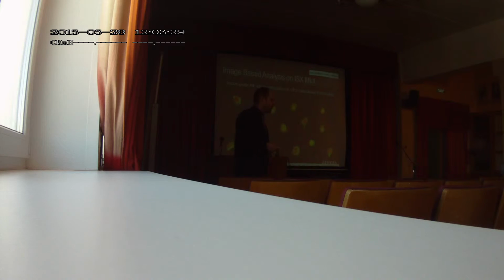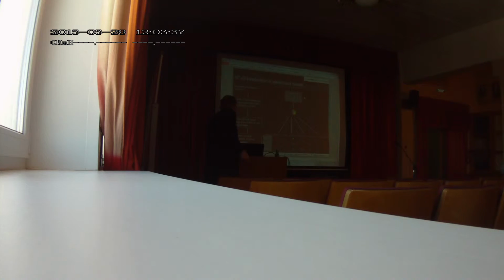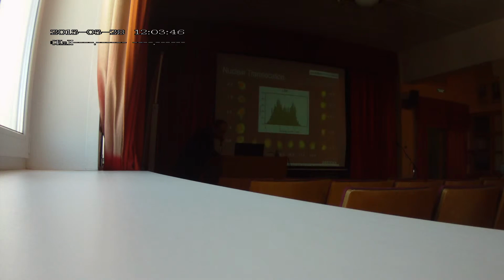But before I go there, from the point of view of the flow cytometer, let me look at the same issue. I'm sorry, something is wrong. Okay.